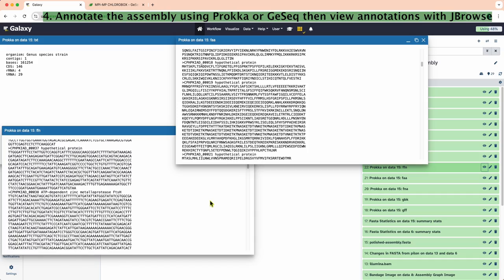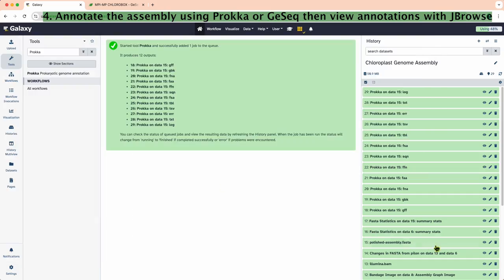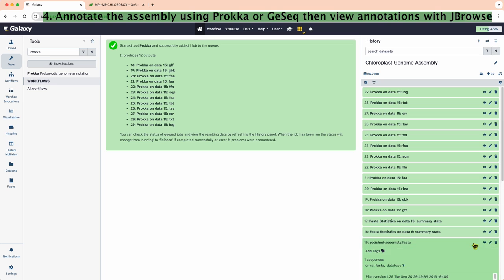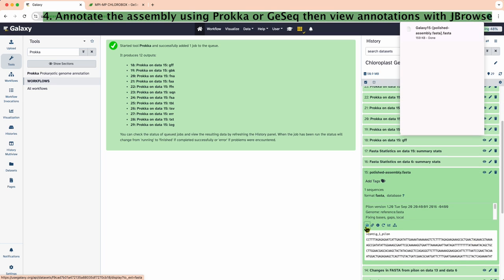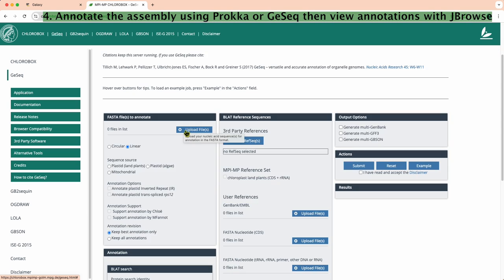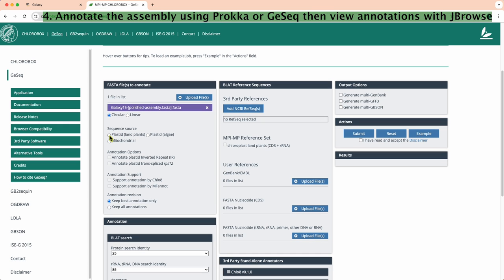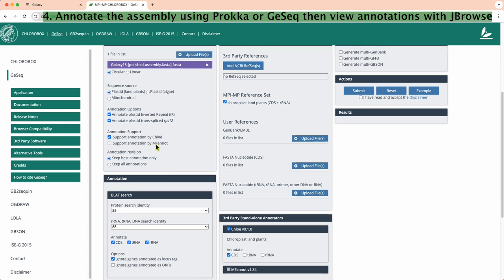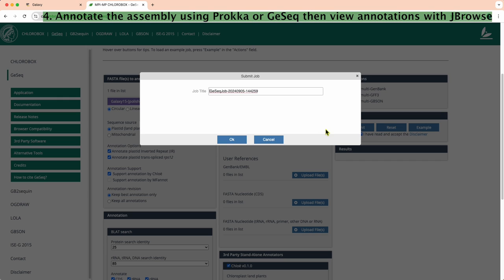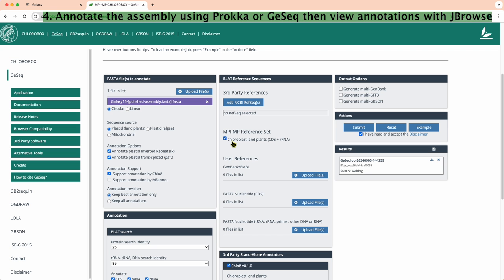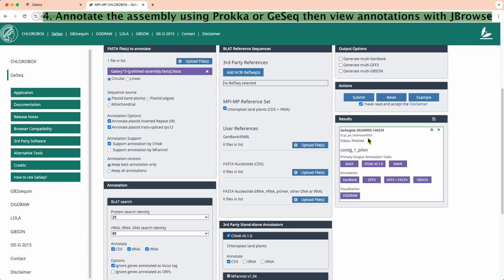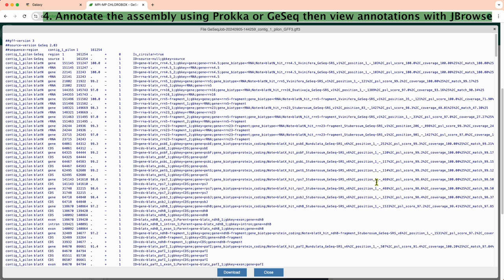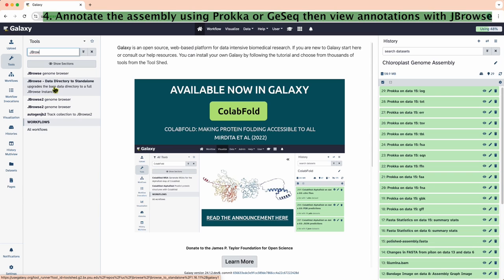As an alternative to Prokka, we can use GeSeq for annotation. First, download the polishedassembly.fasta file from the history. Upload this file to the Chlorobox web application and adjust the parameters as needed. Click Submit to start the process. Here is what the GFF file from GeSeq looks like.